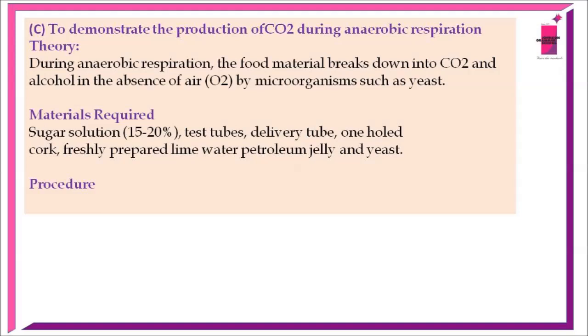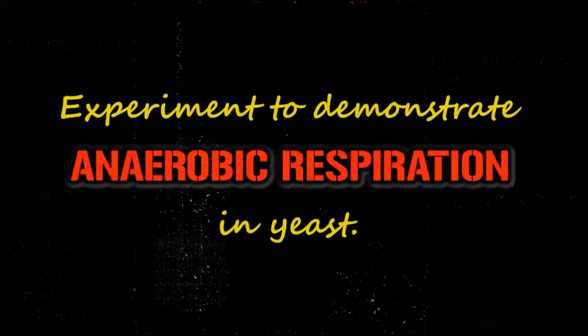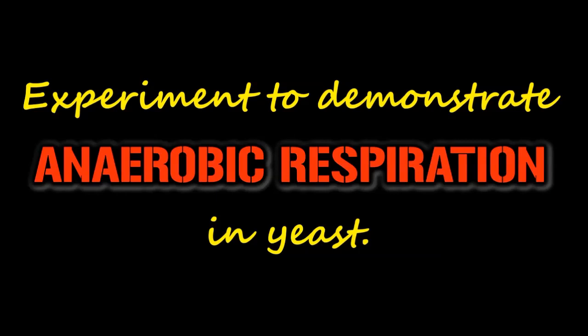Materials required. Sugar solution, concentration should be approximately 15 to 20%. Test tubes, delivery tube, one holed cork, freshly prepared lime water, petroleum jelly or Vaseline, and yeast powder. Procedure. Observe the video carefully to get a clear picture about the procedure. Experiment to demonstrate anaerobic respiration in yeast.